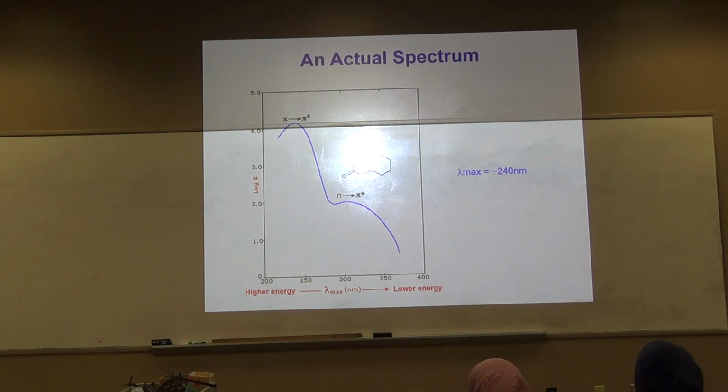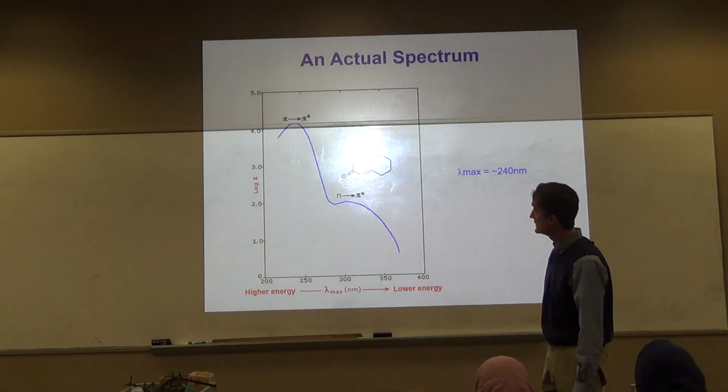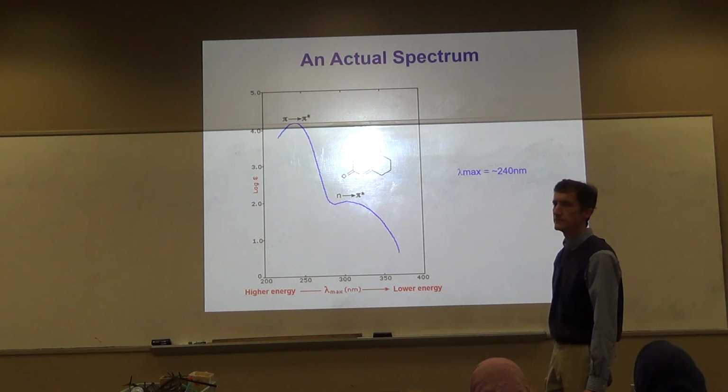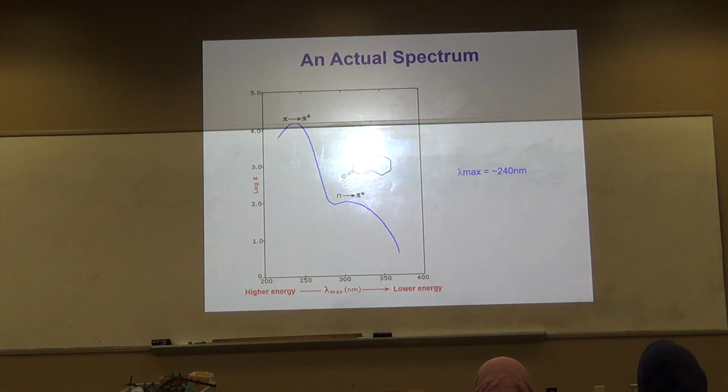Dr. Stevens, are the units on the y-axis still units of absorbance? Essentially, they can vary. It looks like log. You can see variations on how that's presented. Not important to us. Essentially, it's some type of absorbance, different units though. These slides come from different sources, so they're not going to be consistent in that regard. But it's not critical.